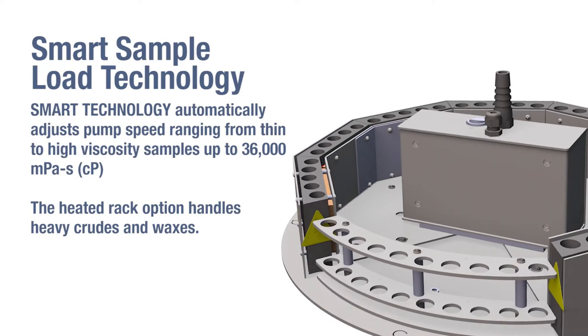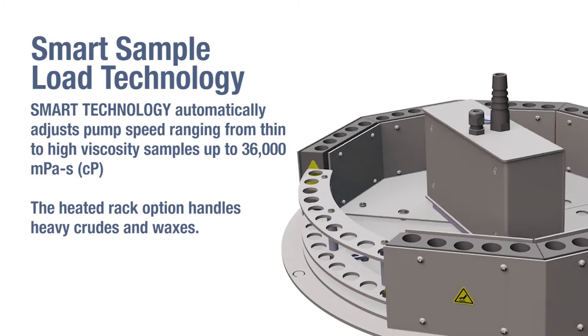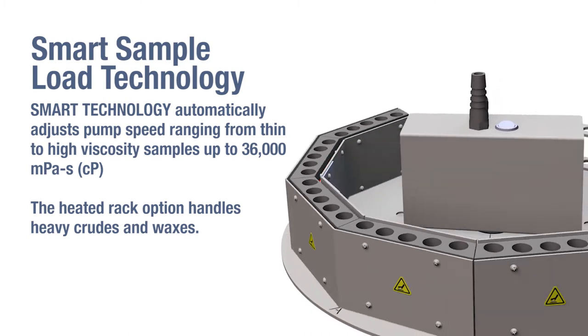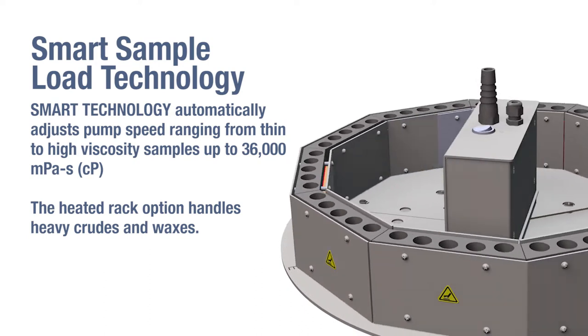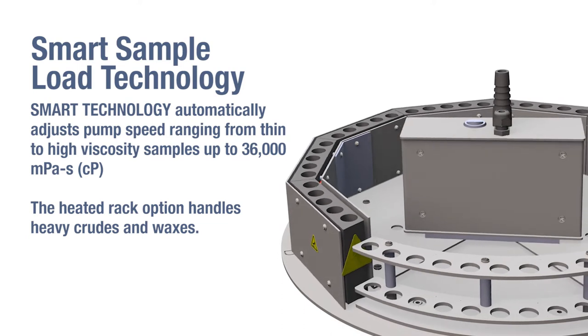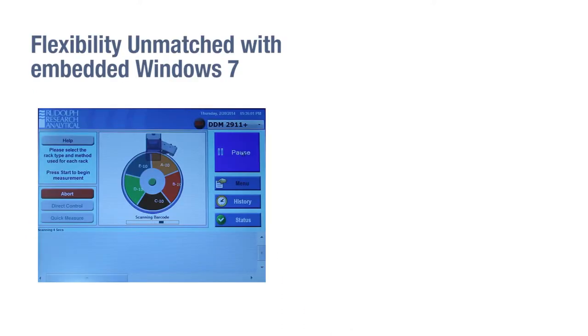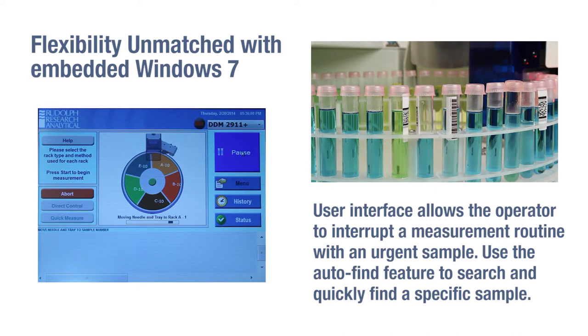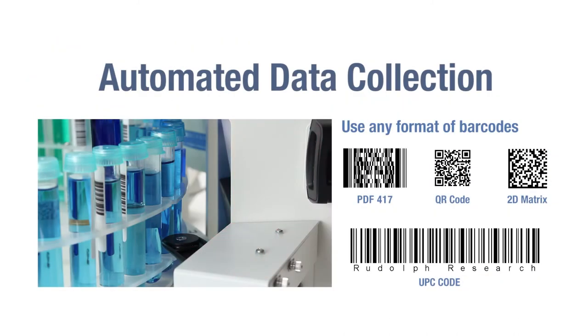Smart sample load technology automatically adjusts pump speed ranging from thin to high viscosity samples up to 36,000 mPa·s. The heated rack option handles heavy crudes and waxes. With embedded Windows 7 flexibility, the user interface allows the operator to interrupt a measurement routine with an urgent sample. Use the auto find feature to search and quickly find a specific sample. Automated data collection is supported.